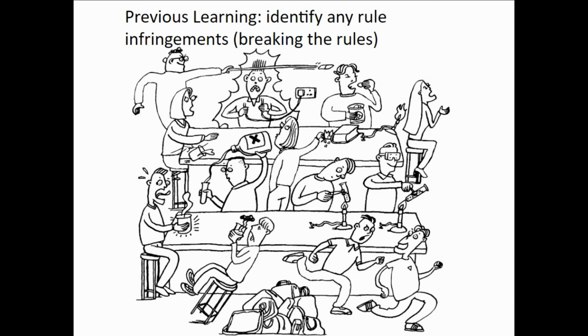You've got, to their left, a big pile of bags that could be a hazard, people could trip over. You've got somebody leaning on a chair, no goggles, holding chemicals near his face, not very good. And then we're back to the person with the hot equipment. It's a very, very disastrous lab situation that. I hope it's none of my classes ever like that.